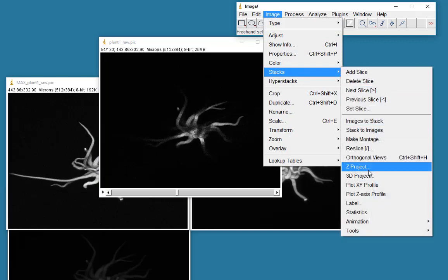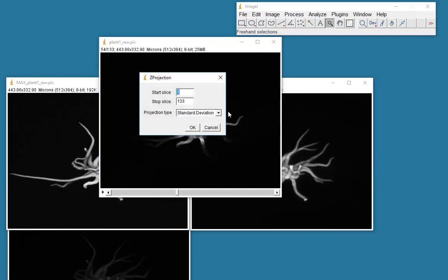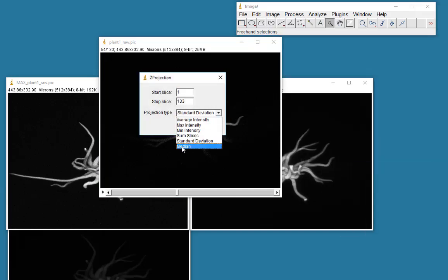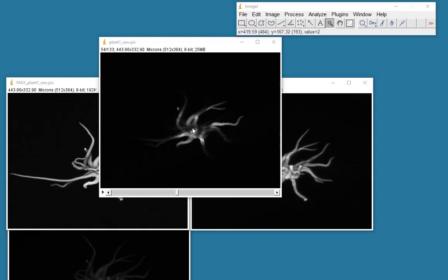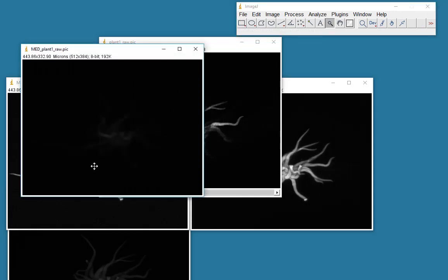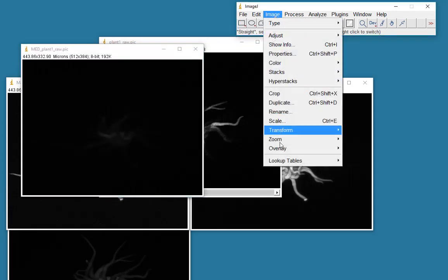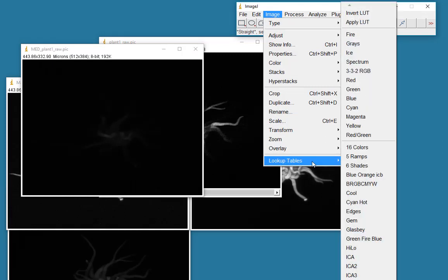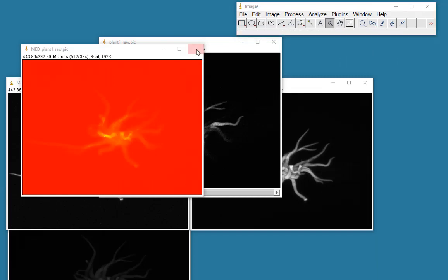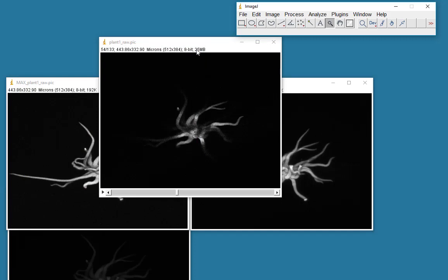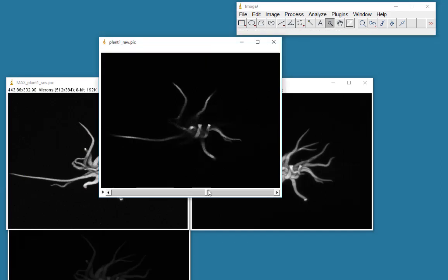And finally, the last option is the median. And that would produce the median value in the column of data, which of course is really quite dim. And we would have to change the lookup table to see if there was anything there. This is not one that I would have normally ever used myself. So that's how to make a Z projection of a data set.